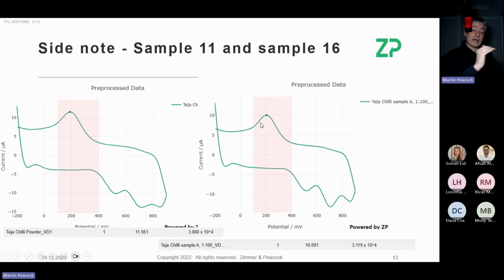And I can also see that it's in quite high concentration, because these people have a certificate of analysis that says this thing is like 84,000 Scoville heat units. So they got a document, they believe it. And I'm saying, guys, I don't care what you say, it's hotter. You can see the molecule.